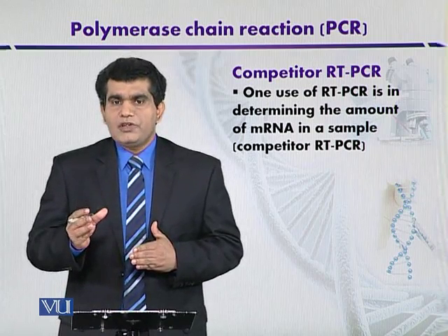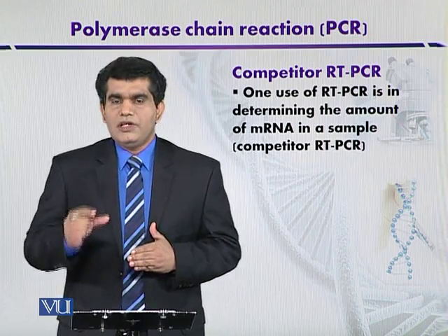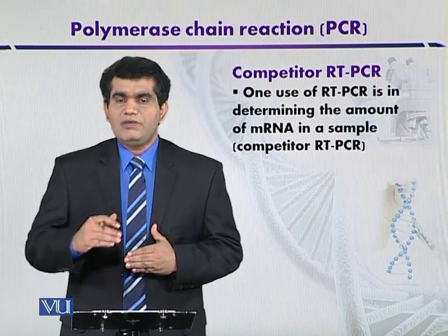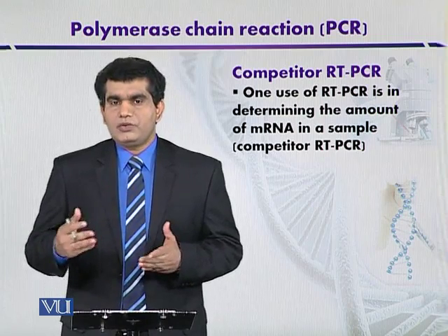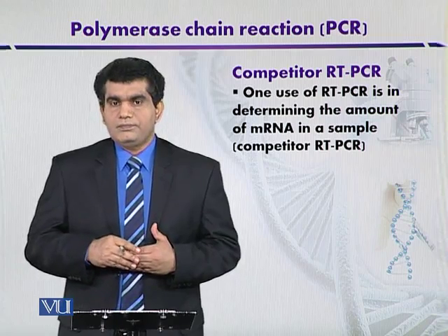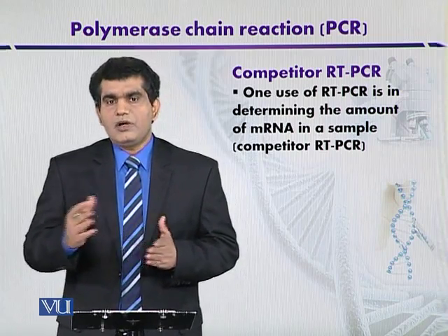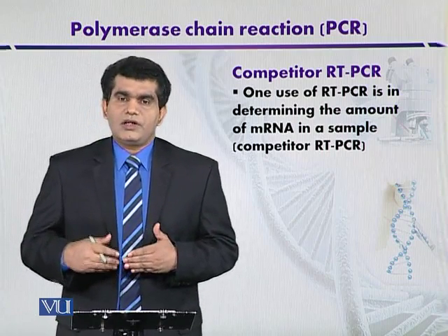तो जब दोनों फ्रेगमेंट्स हों टारगेट भी और हमारा कंपटीटर भी रिएक्शन मिक्सचर के अंदर एक ही वायल के अंदर, तो ये दोनों जो हैं कंपटीटर आरएनए और target RNA, they will both compete for the resources, for the primers, for other resources in the reaction mixture. So both will amplify together. And we also manage the reaction in such a way that one fragment like the competitor RNA to be larger or smaller in size as compared to the target RNA.